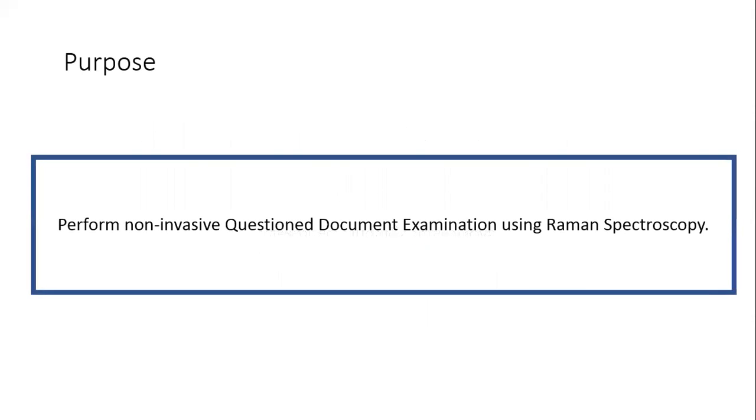In one sentence, the purpose of my project was to perform non-invasive questioned document analysis with Raman spectroscopy. I now quickly want to go through the necessary vocabulary so that this sentence makes sense to everybody.